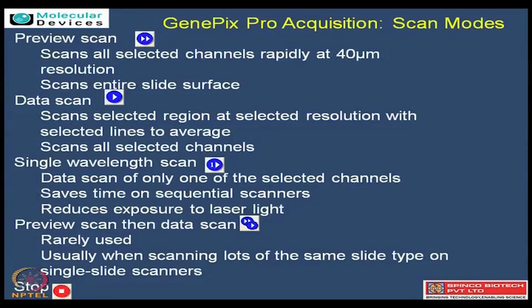The basic GUI, which we are going to see in a few minutes, contains three different areas. The first one is image laser controls, where you see which kind of laser I am going to use. The second one is the different features used for controlling the image. And towards the right-hand side, we have a pane which is helpful for hardware controls.